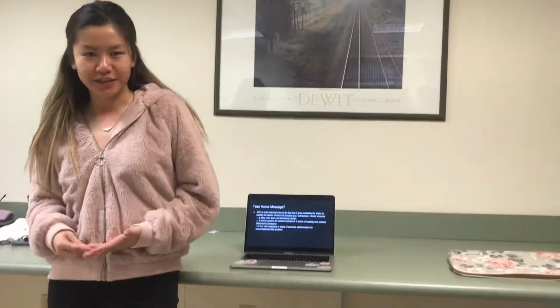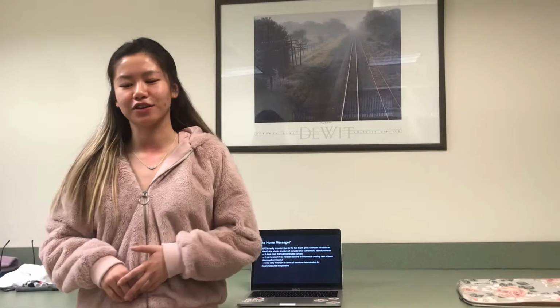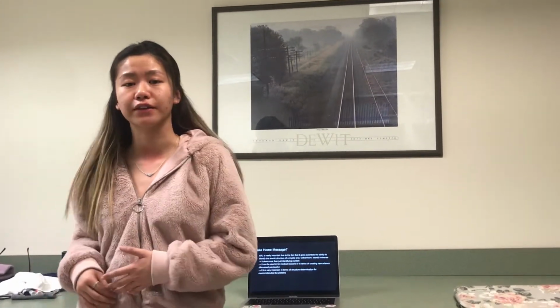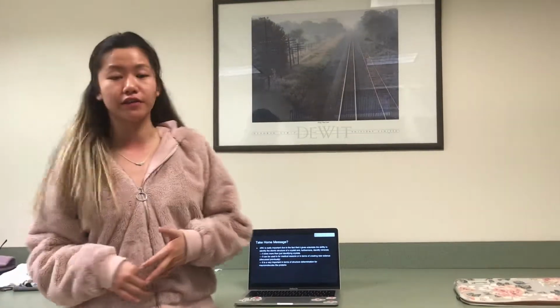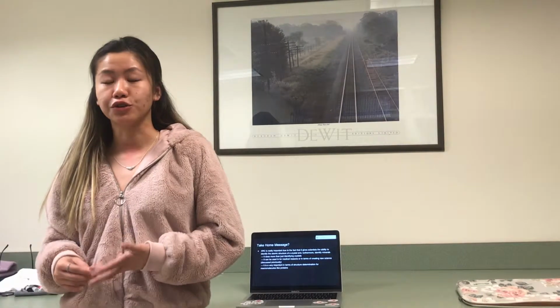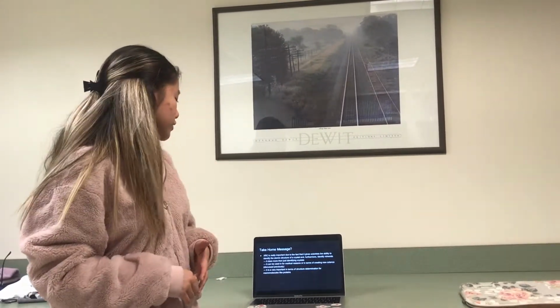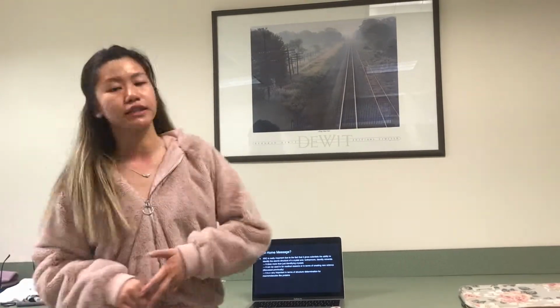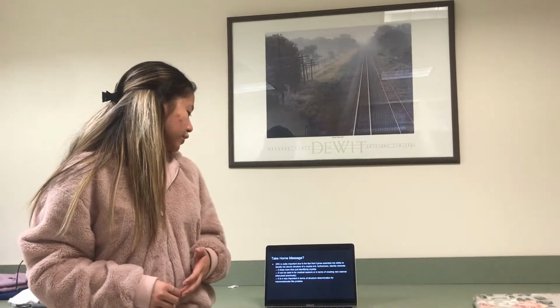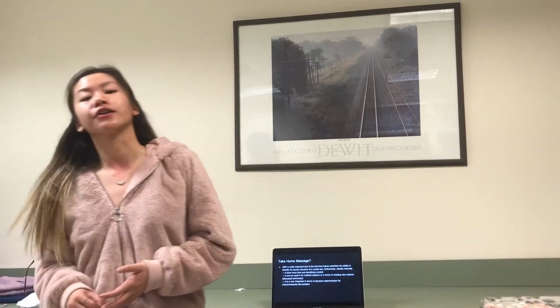So our take-home message for this entire video is basically that XRC should be known more, especially for its atomic structure determination. We should definitely use it more and take advantage of it, especially since, due to our technology, it's really useful and efficient. It is also really important not only to identify crystals, but also for medical reasons in helping synthesize macromolecules. And in general, it's important for structure determination, especially for macromolecules like proteins.